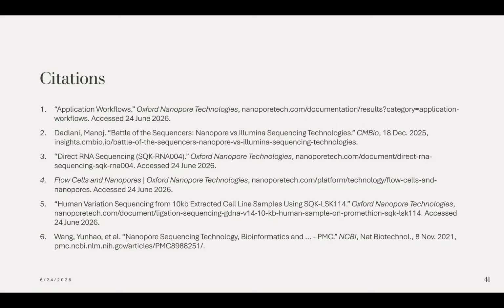I don't do barcoding personally, at least not yet. ONT does offer this, so we can multiplex up to 96 samples. We're looking into 384 for our microbial applications. But right now we offer up to 96, and we can help you determine an appropriate amount of barcode input, so anywhere from 1 to 96. And then we can do lower inputs. If that's useful, I understand a microgram isn't a lot from cell culture, but it's a lot from other samples. So we can go as low as 250 nanograms.